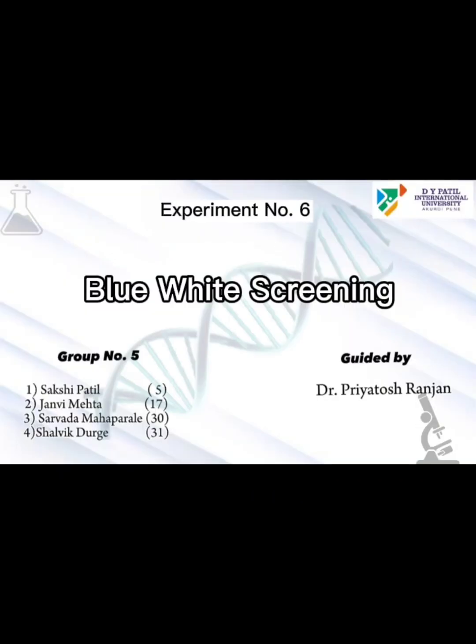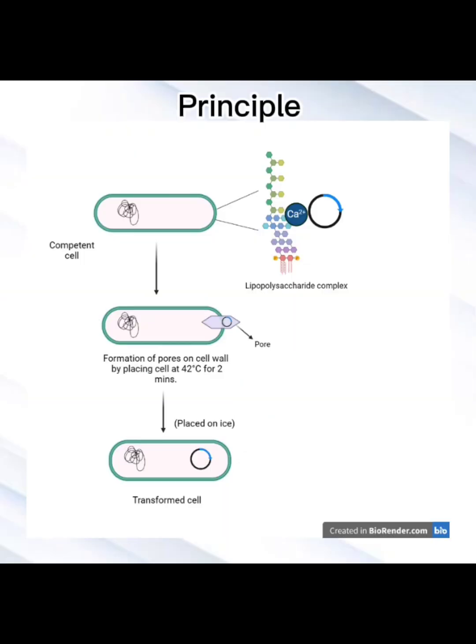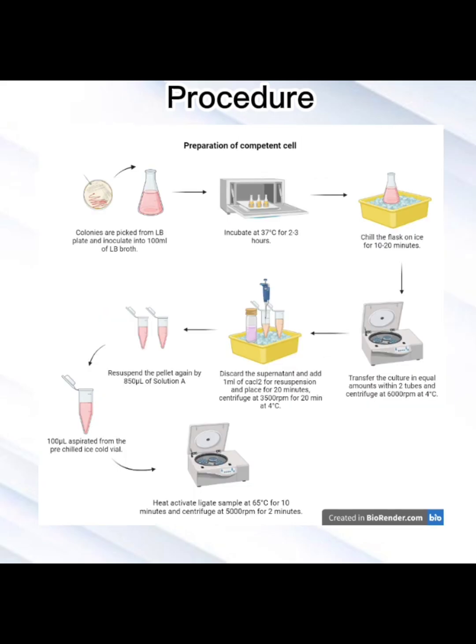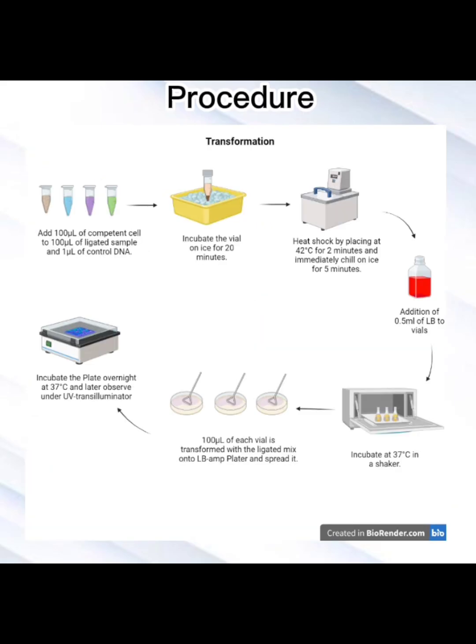Blue-white screening. Blue-white screening is a biological technique, particularly in the context of pUC19, commonly used in plasmid and cloning experiments. This method detects recombinant bacteria by leveraging alpha complementation as a recombinant marker. The technique lies in the enzymatic activity of beta-galactosidase encoded by the lacZ alpha gene, which metabolizes lactose to galactose and alternatively can hydrolyze X-gal to 5-bromo-4-chloroindoxyl to produce blue pigmentation.